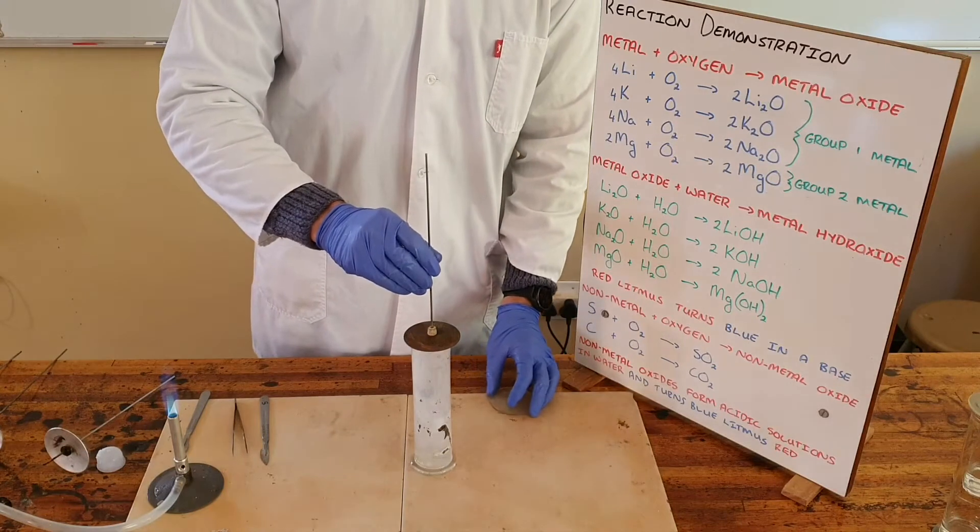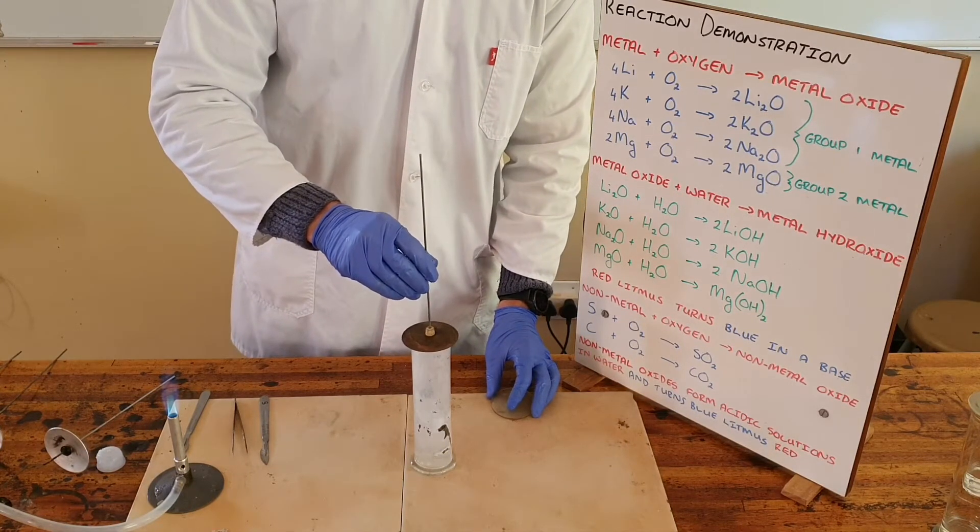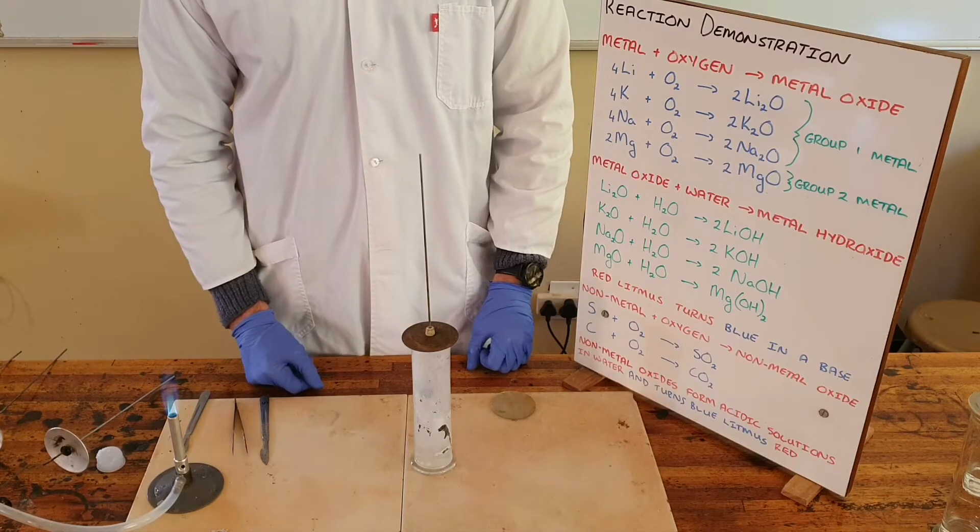We can see that the magnesium forms a very rapid reaction in which it gives off a lot of heat and burns a bright white color.